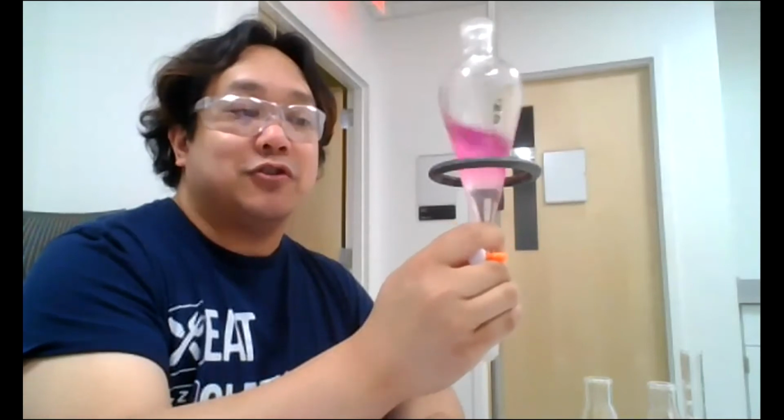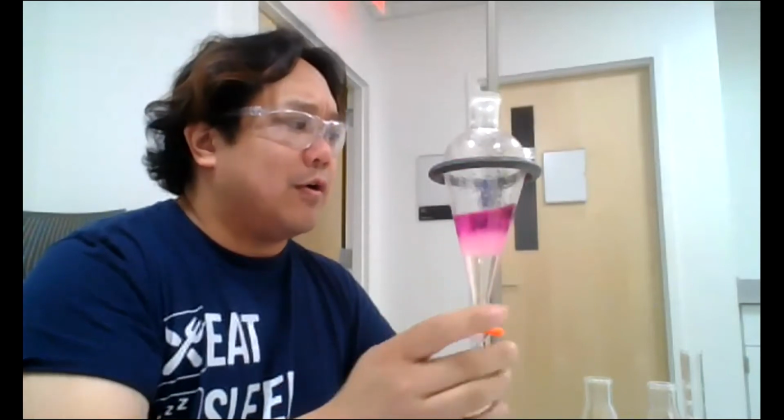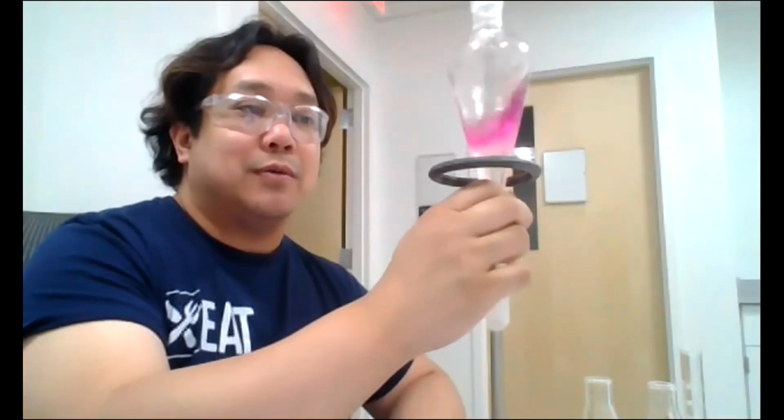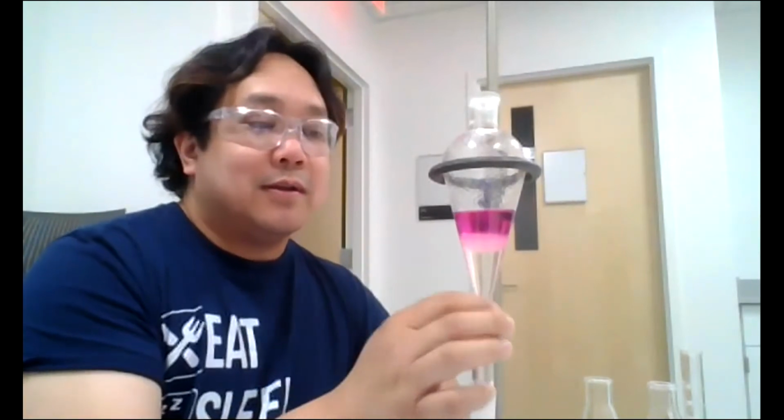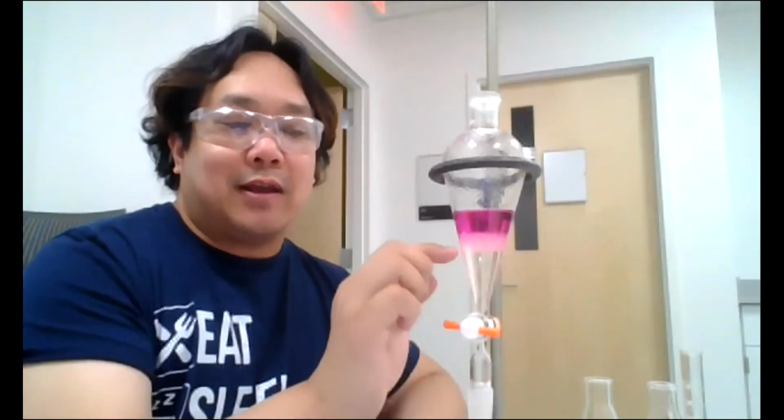Sometimes you get what's called an emulsion, right? You know, oil and water, mayonnaise? I'm not sure what mayonnaise is actually, but mayonnaise is an emulsion because normally the ingredients that make mayonnaise separate, but they whip it up. They create a lot of surface contact between the two or three immiscible ingredients, and they form mayonnaise. Same thing here. We're getting an emulsion. Not that bad, but definitely we're not getting a clear demarcation between the two layers.